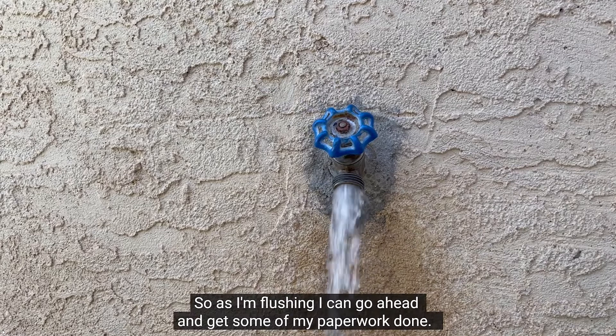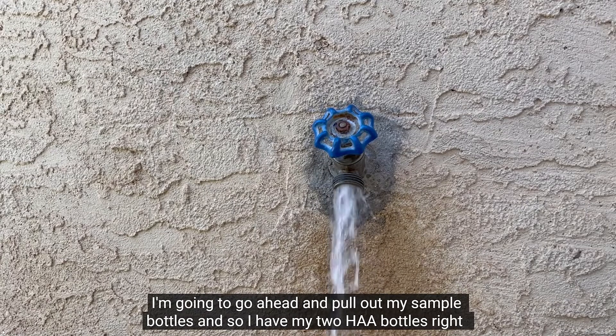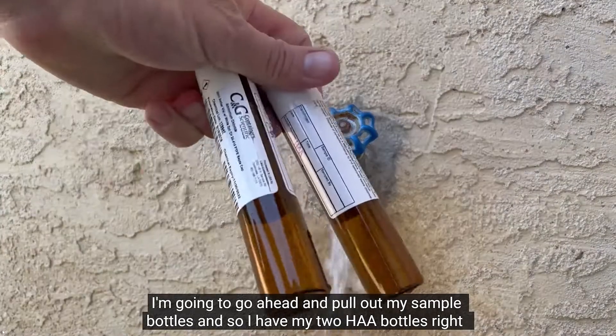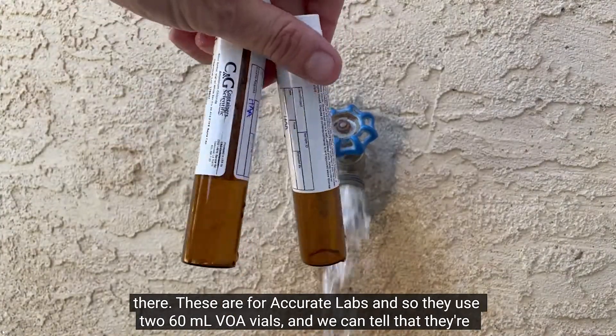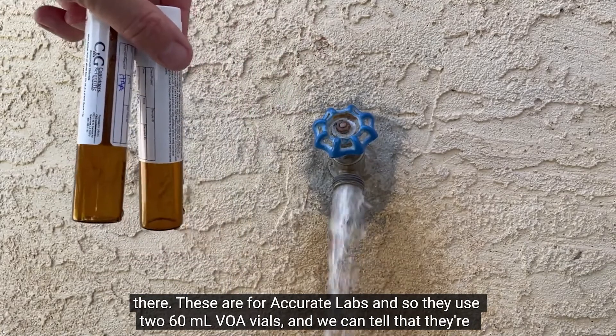As I'm flushing, I can go ahead and get some of my paperwork done. I'm going to pull out my sample bottles. I have my two HAA bottles right there — these are for Accurate Labs, and they use two 60 ml VOA vials.